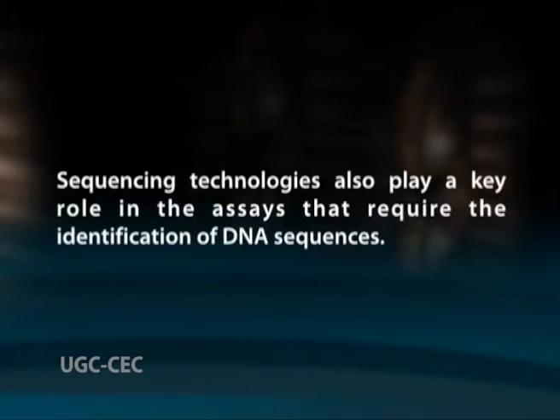Sequencing technologies also play a key role in the assays that require the identification of DNA sequences. Examples of such use include the serial analysis of gene expression and its updated version, the CAP analysis of gene expression. Both methods measure the relative frequency of different RNA transcripts in a high throughput fashion.